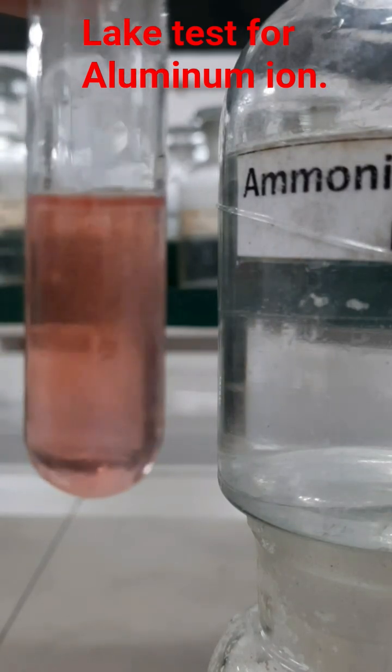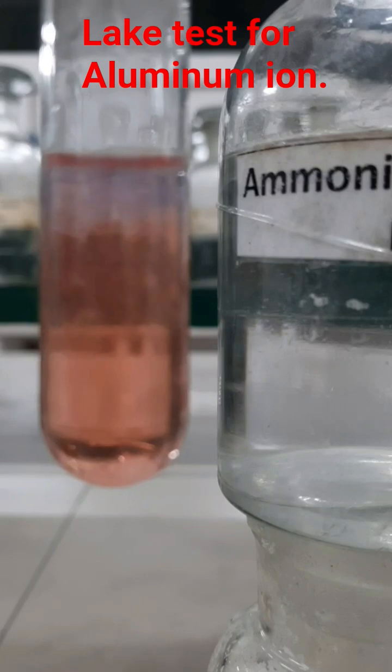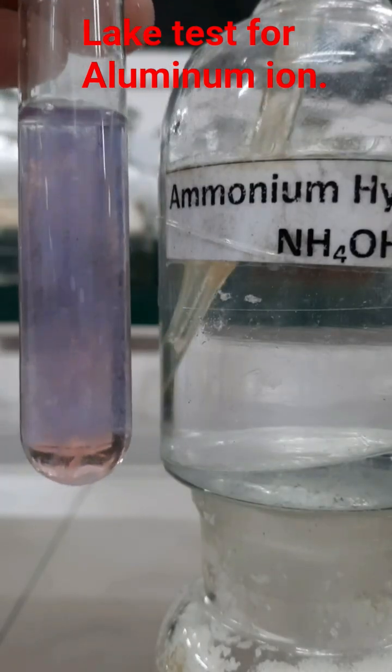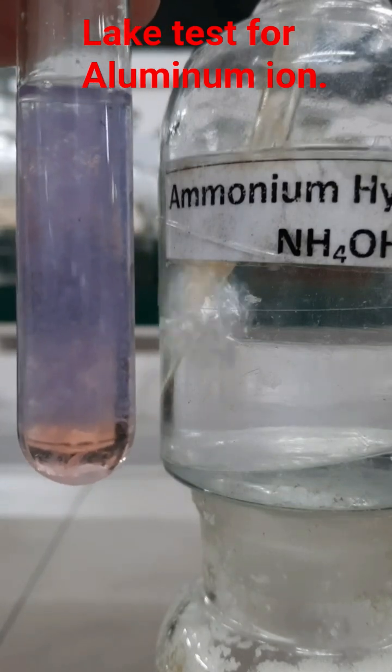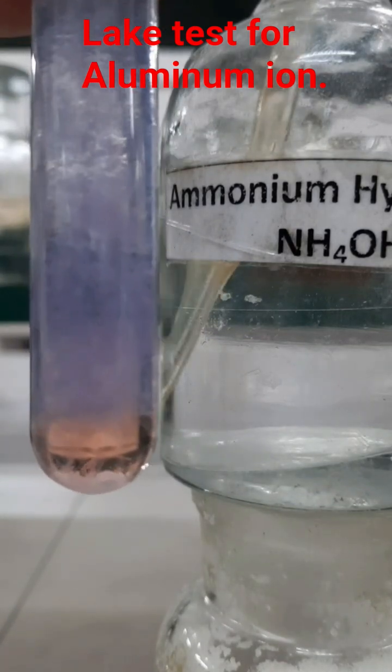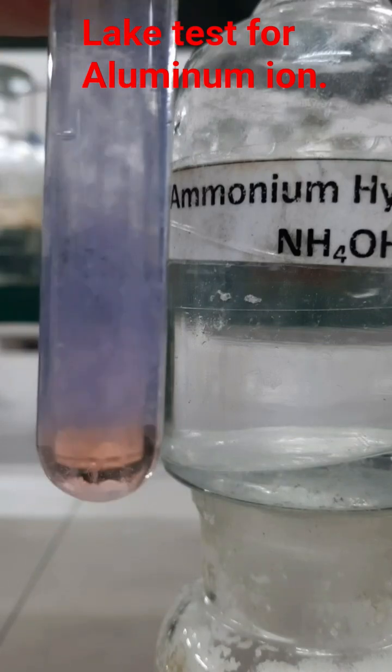After adding ammonium hydroxide solution, again you will get the gelatinous precipitate of aluminum hydroxide. It acts as a good adsorbent also, and the color of the precipitate will turn blue due to the adsorption of this blue litmus dye over it.